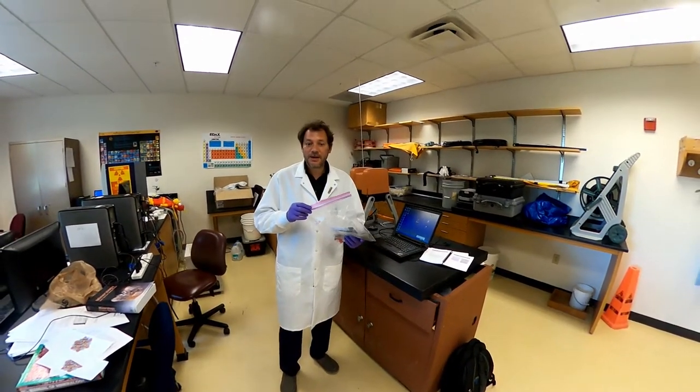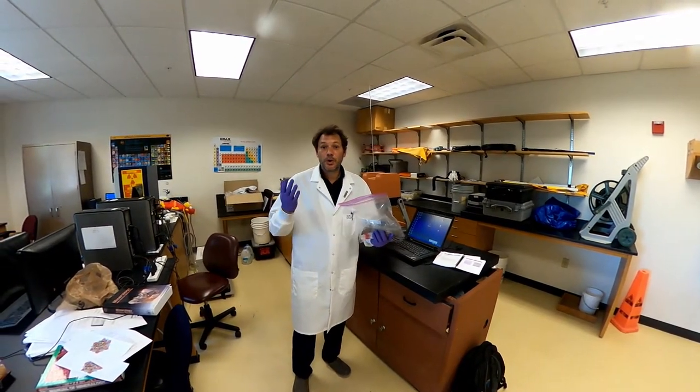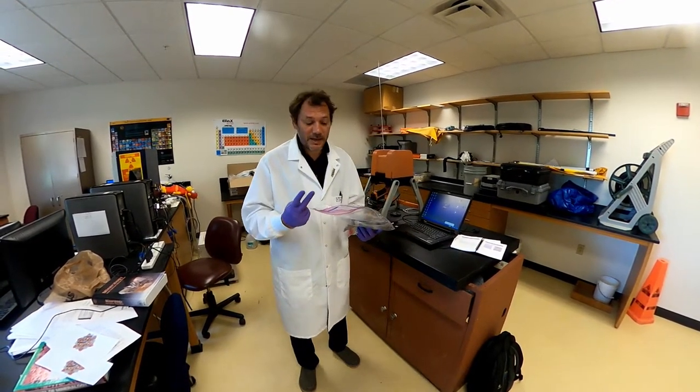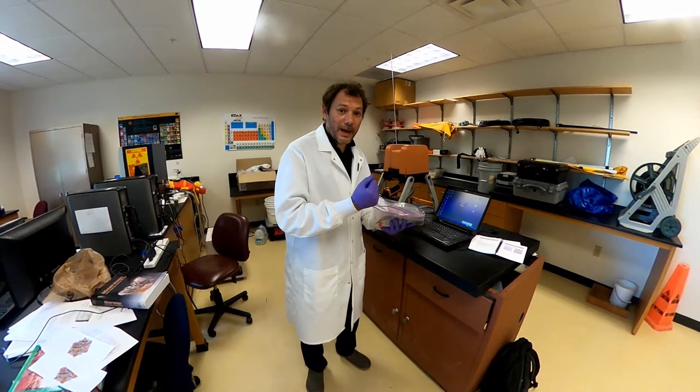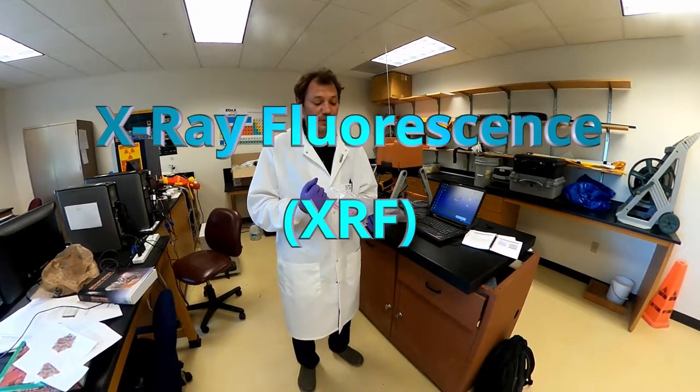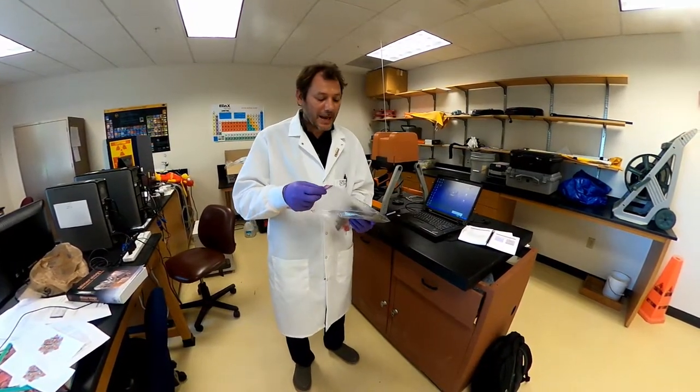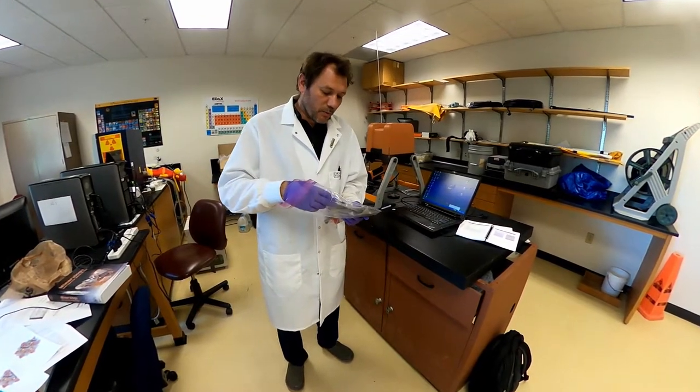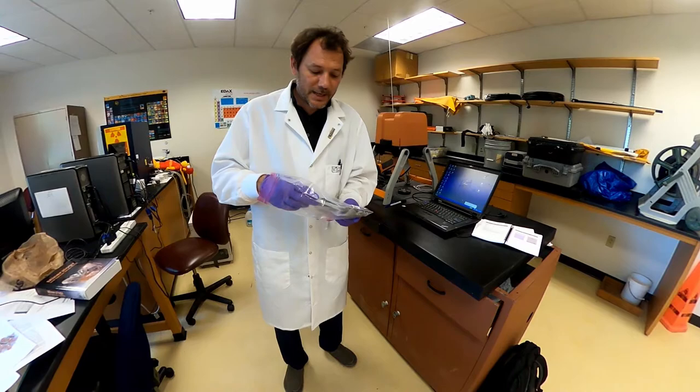So today's lecture is dedicated to analyze these samples and we're going to do two different types of analysis. We're going to do X-ray fluorescence for solid samples and ICP for liquid samples.